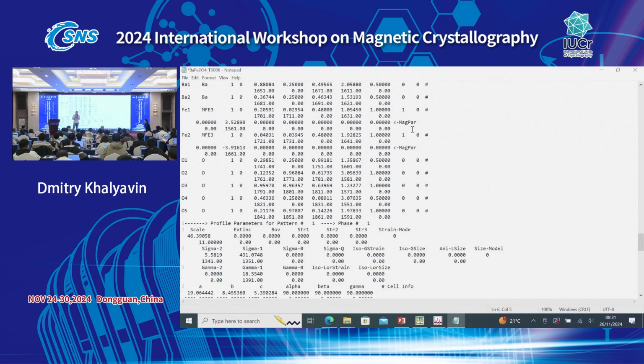No, yes, your magnetic moment will be scaled too. So it depends again. Why do you have two magnetic phases? Because if there is only one nuclear phase, it's very unlikely you have two magnetic phases. So there must probably be two nuclear phases as well, right? And if the nuclear scattering from these phases does not overlap, you should be able to refine your data, because the scale factor for each of them will be independent, and you should be able to refine them independently, and scale your moment size and scale your phase fraction in this case.